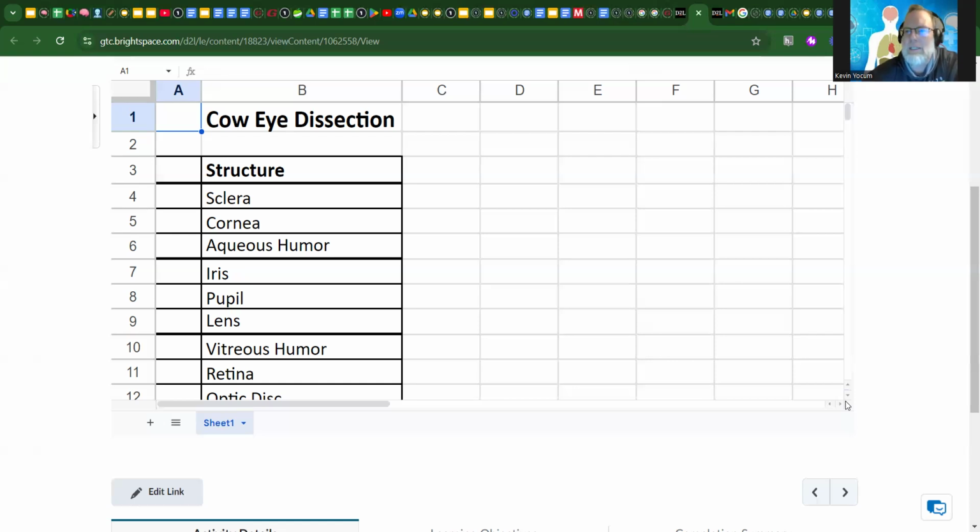We don't necessarily consider those skeletal muscles per se, even though they are. They do attach to the orbit of the eye, and they certainly have names, just like our skeletal muscles do. What I'm saying is we don't think of them as moving a limb or an appendage. But you'll see some skeletal muscles. So the first thing we have to do is remove all of that skeletal muscle. We want to be focused on the eyeball itself.